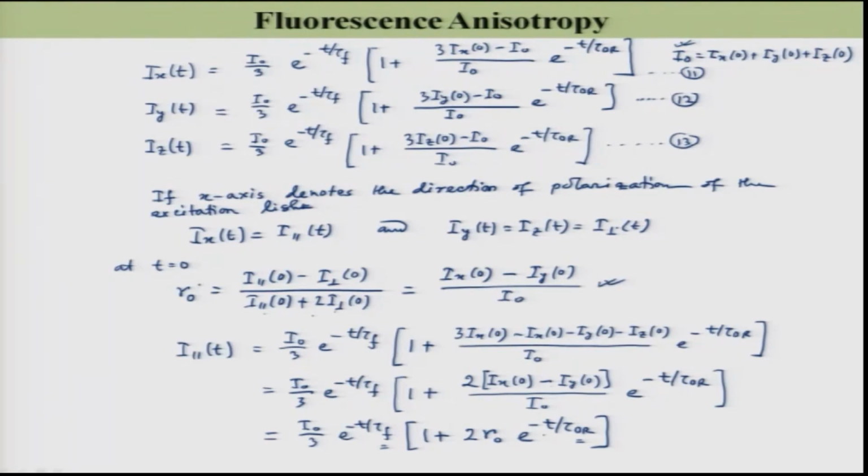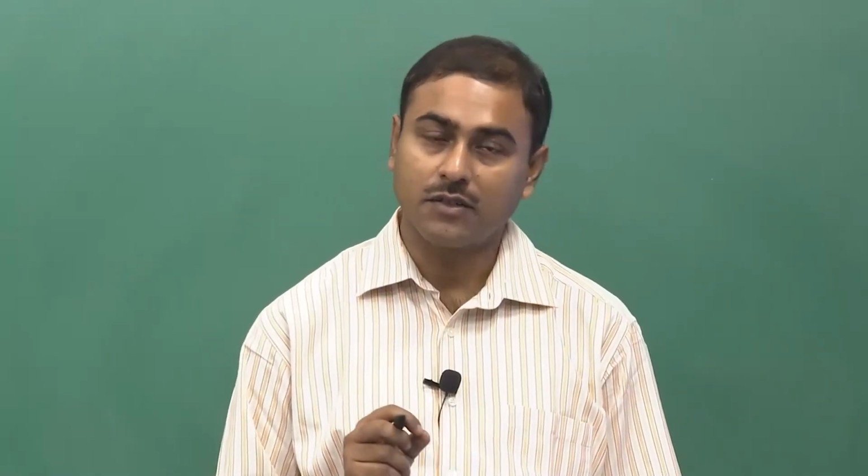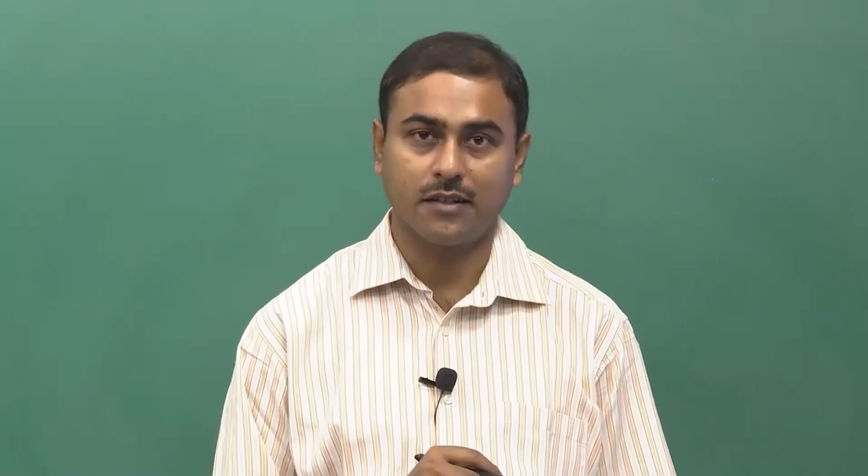Similarly, next day I will calculate this I perpendicular t, and then I will see when I plug in this I parallel and I perpendicular into my original equation of anisotropy, how the rt will look like. Thank you very much.